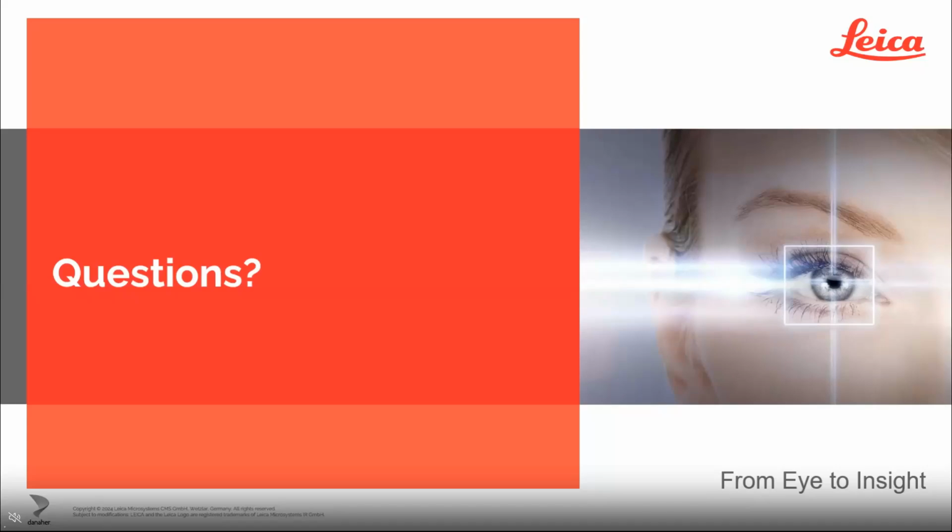Excellent. Thank you. All right. Our next question says, can the auto trimming and auto alignment functions be used under cryo conditions, or only one of each function can be used under cryo condition? Maybe Andrew, you can comment on that. Sure. It's a good question. The short answer is no. It is not possible to do auto trimming and auto alignment under cryo conditions. These motorized components are not compatible with the cryo chamber.